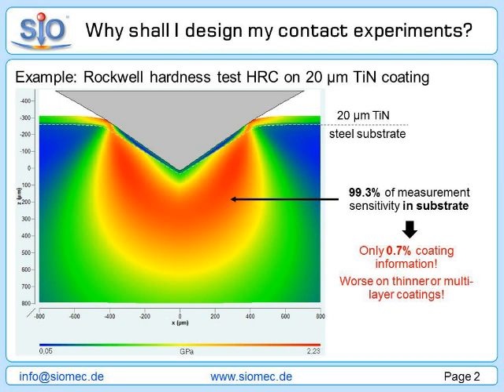Exactly 99.3% of the measurement information is coming from the substrate. And this means in turn that only 0.7% of the measurement information is coming from the coating.